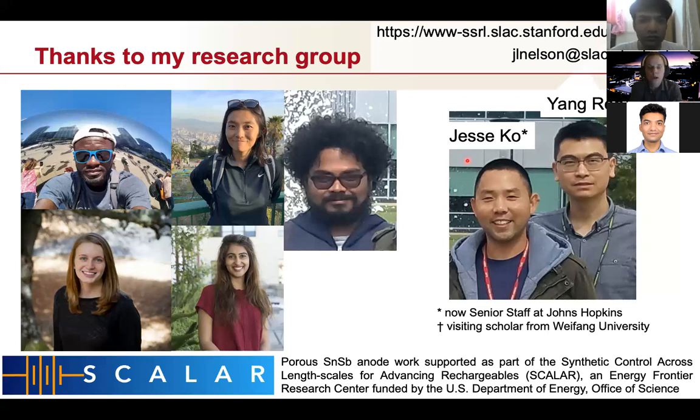So we don't really detect gases; most gases we're not sensitive to. For the catalyst work, we have hooked up a mass spec on the out valve to track what materials we're forming. We could think about doing something similar for a battery, to look at the morphology changes, but then map that to whatever you're seeing in the mass spec. But no, the X-rays aren't going to detect the hazardous gases.